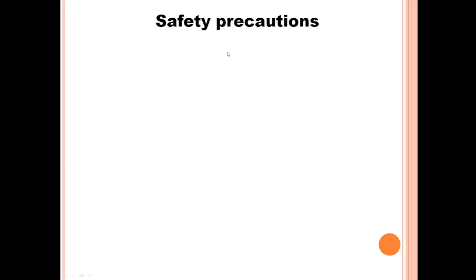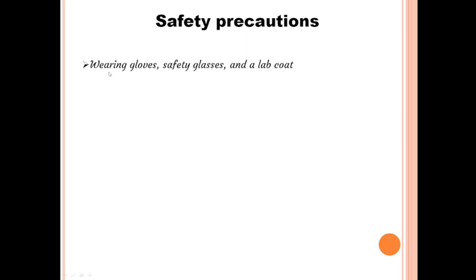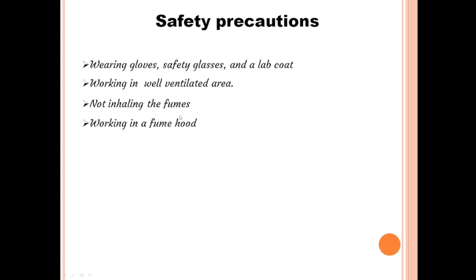Safety precautions are essential when working with formalin due to its hazardous properties. Personal protective equipment (PPE) such as gloves, lab coats, and safety goggles should be worn to prevent direct contact with formalin. Working in a well-ventilated area or using a fume hood helps minimize exposure to formaldehyde vapors, which can cause respiratory irritation and other health issues.